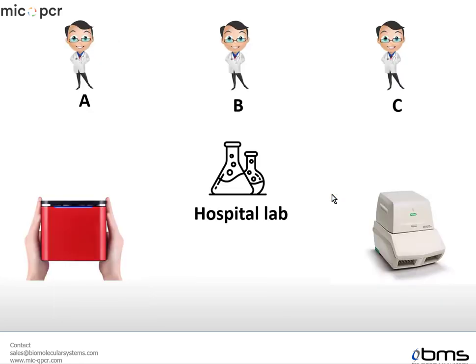Although the example given here is for a service lab, it can be used in any hospital lab as well, where you have, for example, 3 doctors requesting any viral test for their patients.